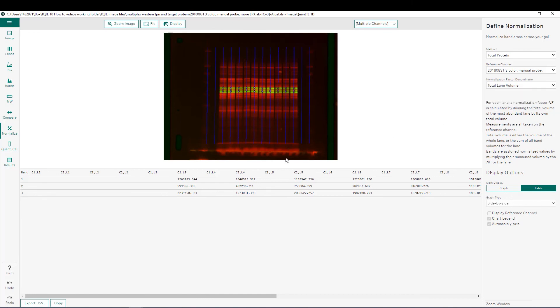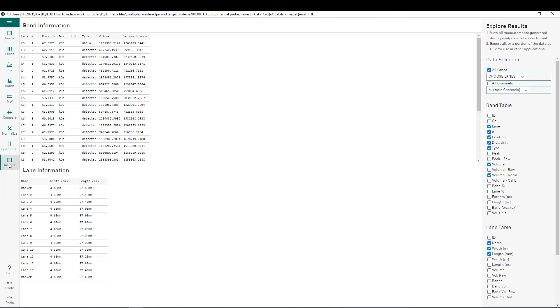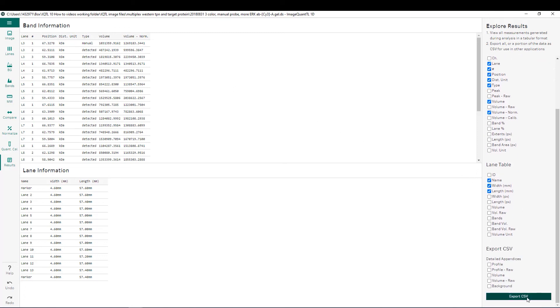We can see that we now have normalized volumes for each one of our bands of interest. We can choose to copy and paste this into Excel, or move on to the Results tab, where all band information is summarized in a table. You can choose which parameters to display by checking different boxes. The most relevant parameters for our analysis are volume and normalized volume for each band. Once you've chosen your parameters, you can export all results as a CSV and open it in Excel.